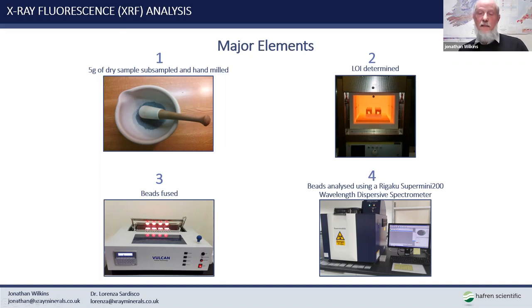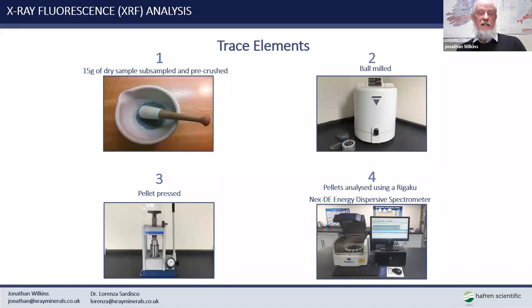So when that beautiful piece of borosilicate glass, I actually keep one here on my desk for no good reason. There is one, it's just a glass disc, more or less colored, depending on its contents, particularly iron, of course, or manganese. That glass disc is then put onto the spectrometer, and the bottom of the sample, which is perfectly flat where it was molded, is illuminated by, wait for it, monochromatic X-rays, and the sample is analyzed by measuring, using diffraction, for goodness sake, the characteristic colors of secondary X-rays that are produced within the sample.